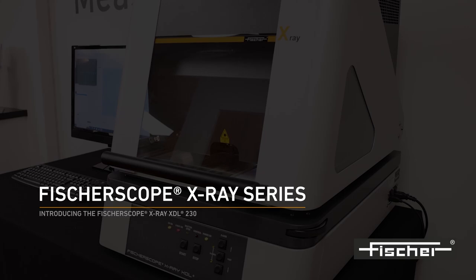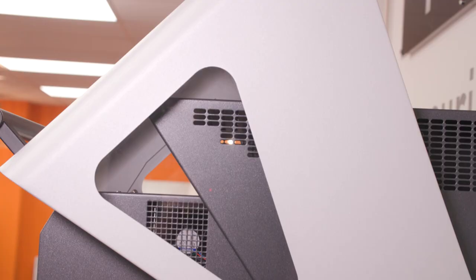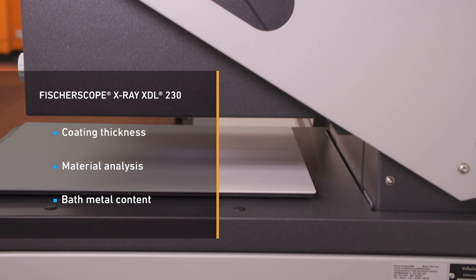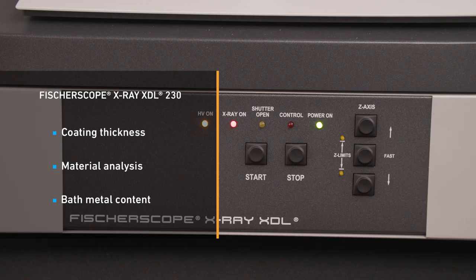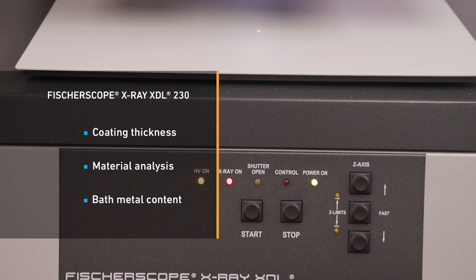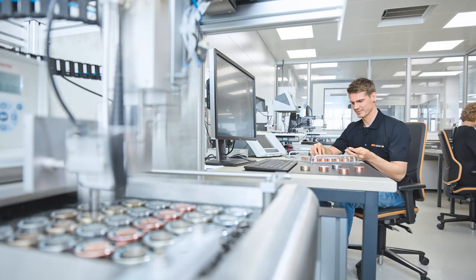Introducing the FischerScope X-Ray XDL-230. The FischerScope X-Ray XDL-230 is a robust, universal instrument for the quality control of electroplated components and plating solution analysis, enabling fast, non-destructive measurements.